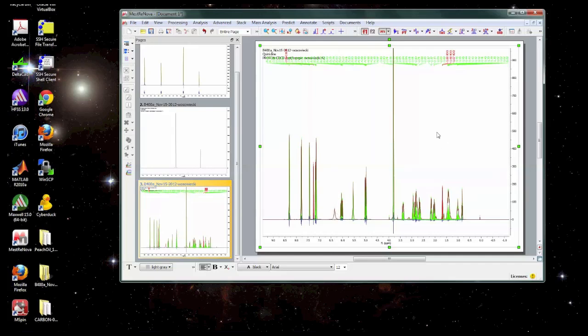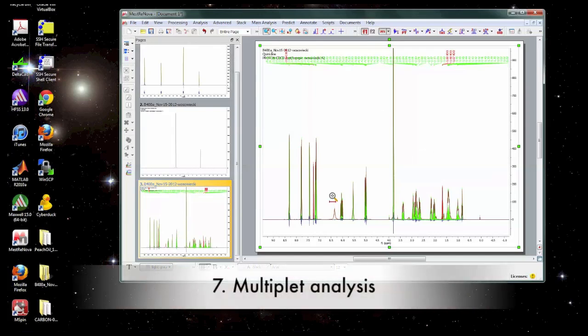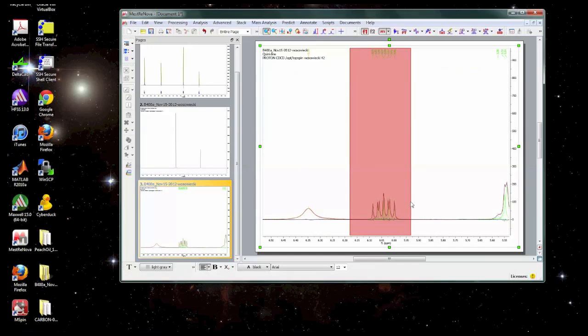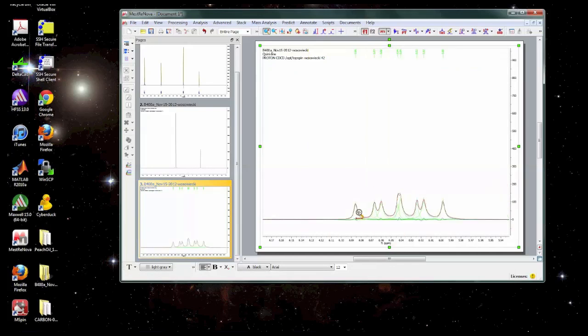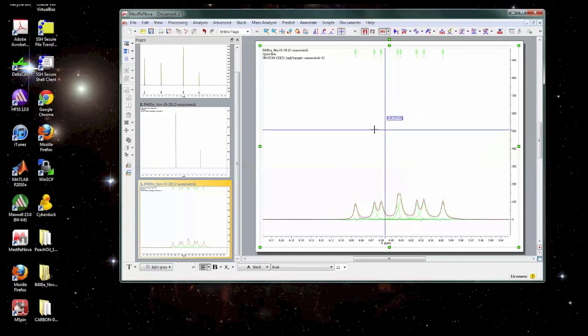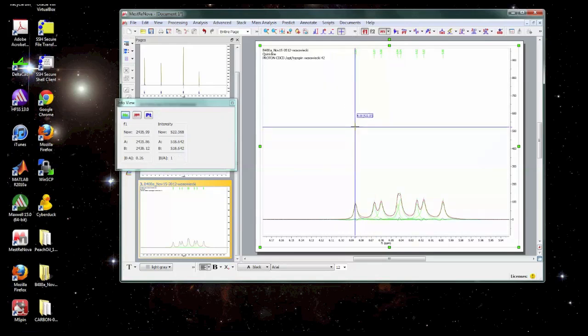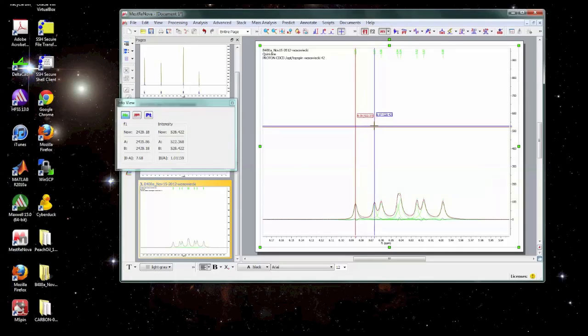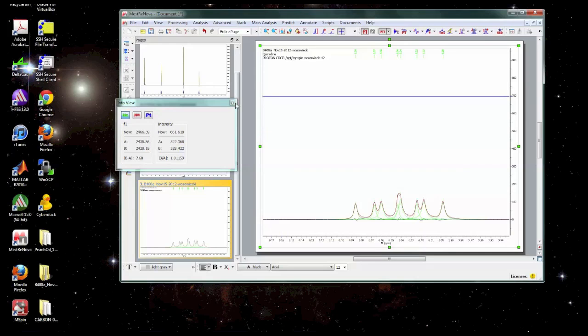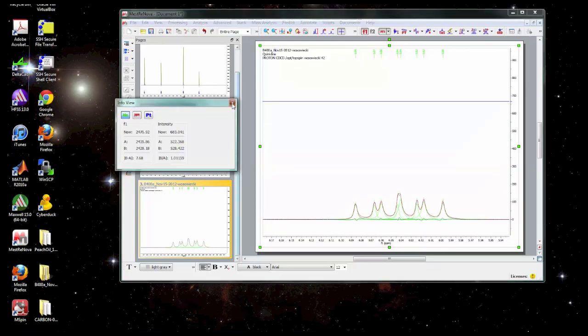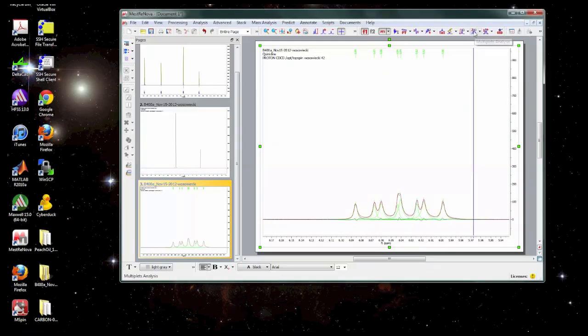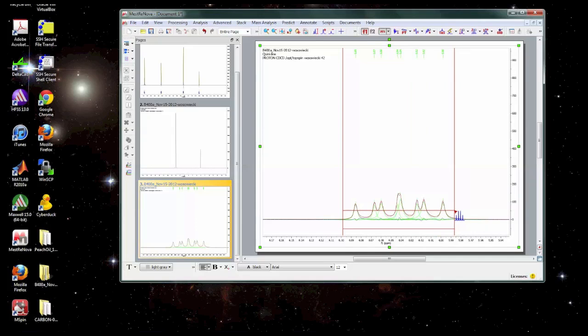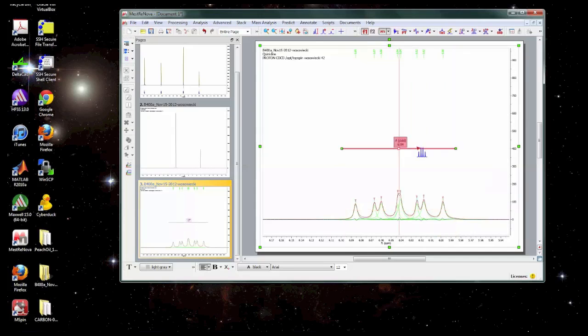Because now we're going to go in and do multiplet analysis. So if we see a series of peaks like this, it's actually one proton that's been split into many different peaks by its J-couplings to other protons. And one way you could try to estimate what the size of those J-couplings are is by measuring the distance on the spectrum, which you can do with these crosshairs. And then you could see what the value is over here on this table. But another way that you could do it is to go in and do multiplet analysis. So this is this button with J here. And we will do manual multiplet analysis for now. And what I want to do is, it's just like picking peaks. I'm going to highlight the peaks that I want to analyze.